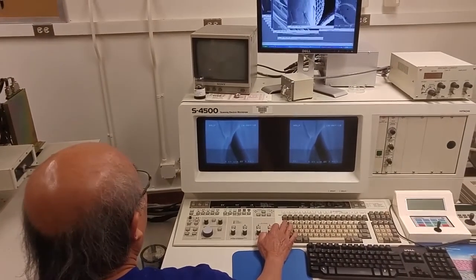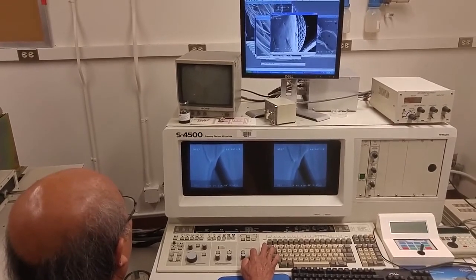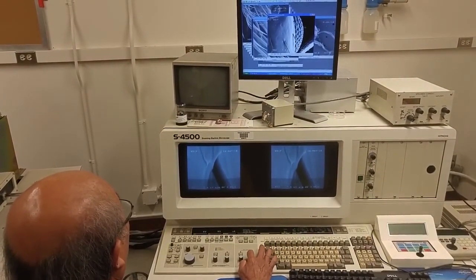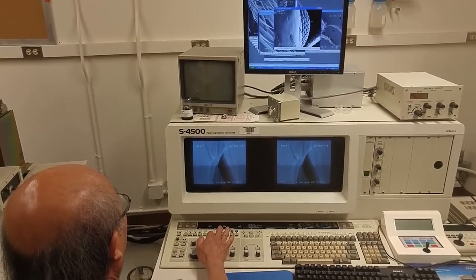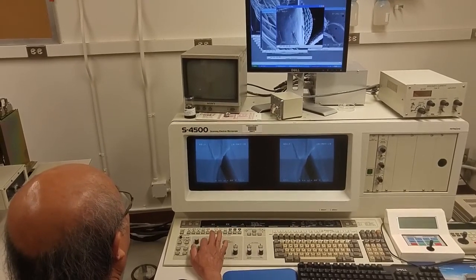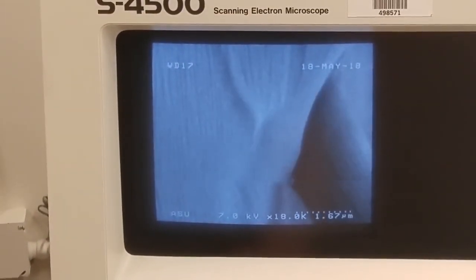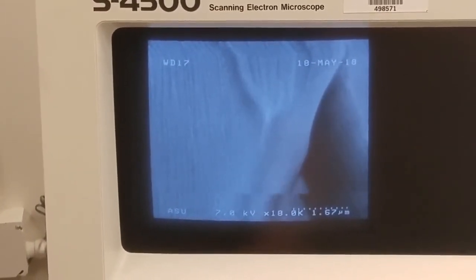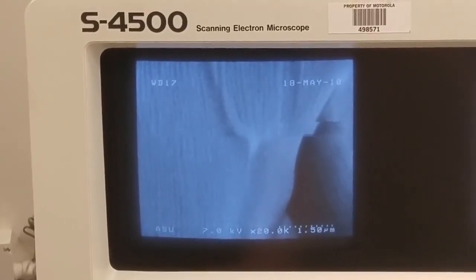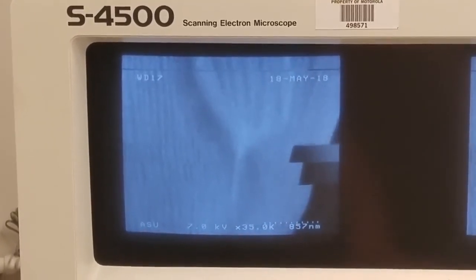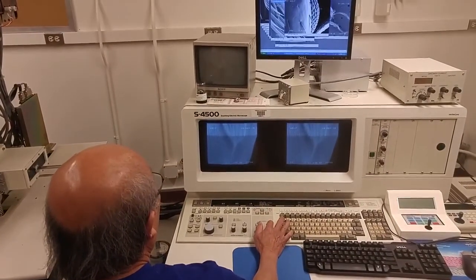Close again. Okay, go ahead and grab a picture. Let me focus it. Get higher — make higher resolution. See the feature here. Let's see detail of the hair. How about the skin? Gotcha. Only 35.